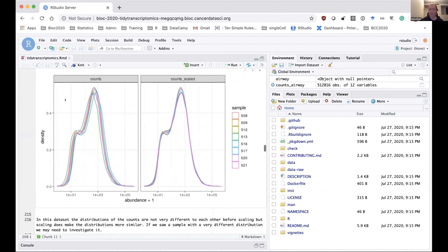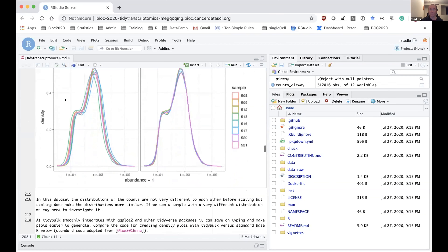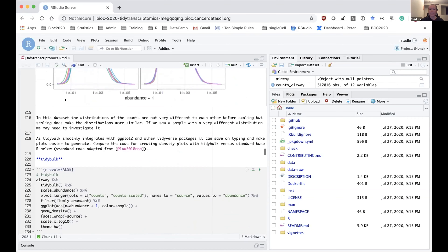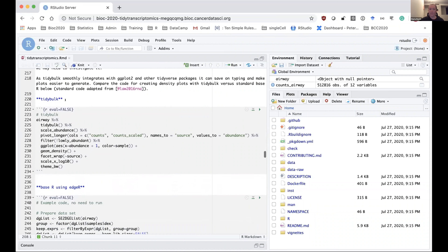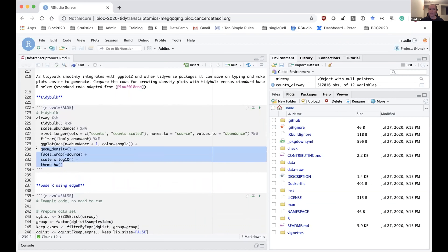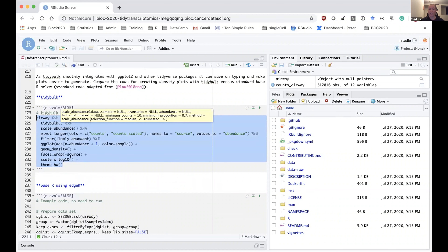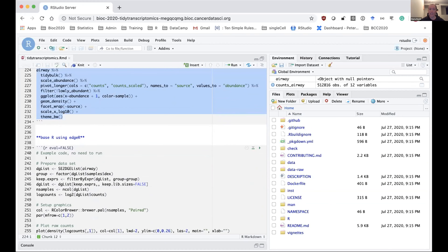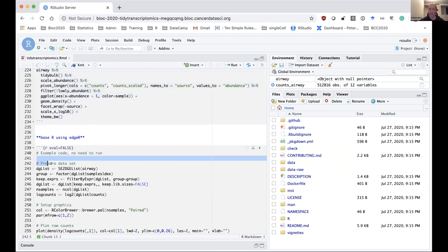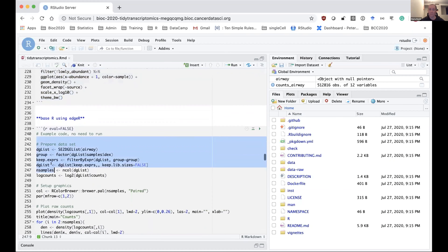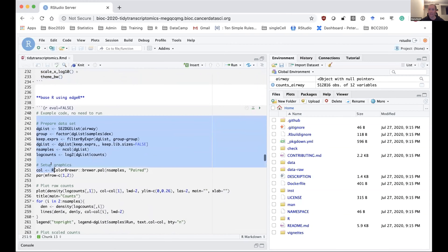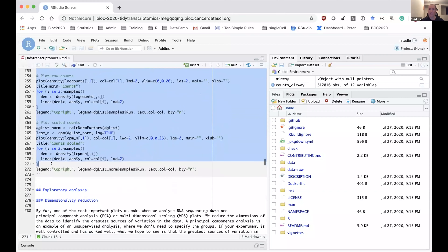To compare: this is the way to generate those density plots using tidyverse and tidybulk. You can see that compared to a base R method to generate similar density plots, there's a lot less code involved in the tidybulk and tidyverse method.